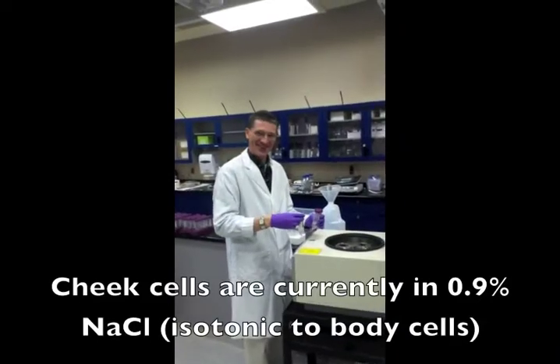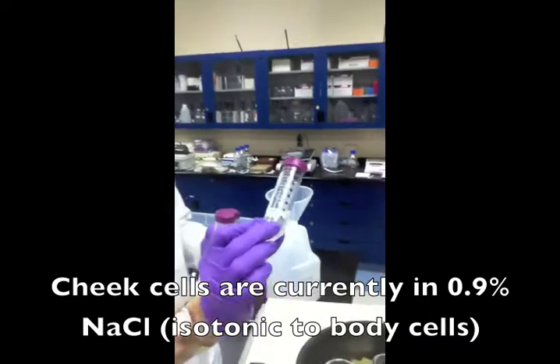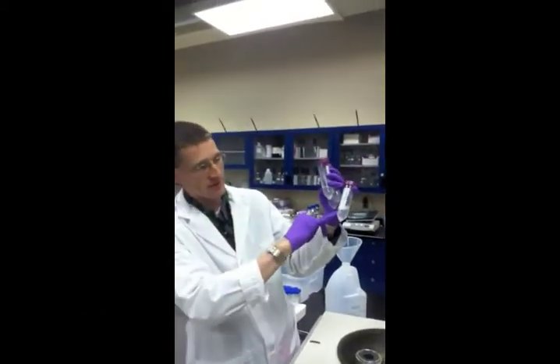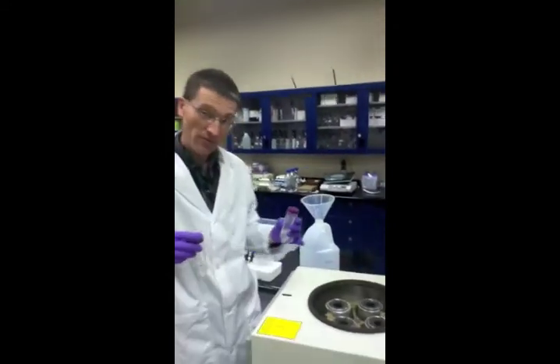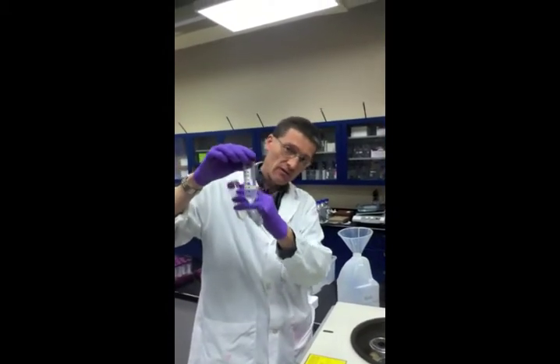Okay, we're on. As you remember, you swished that 0.9% sodium chloride solution in your mouth back and forth, and besides your lunch, we also have some of your squamous cells, or your cheek cells. And that's what we want. We're going to take the DNA from those cells. But first, they're diffuse in this solution of 10 mils.